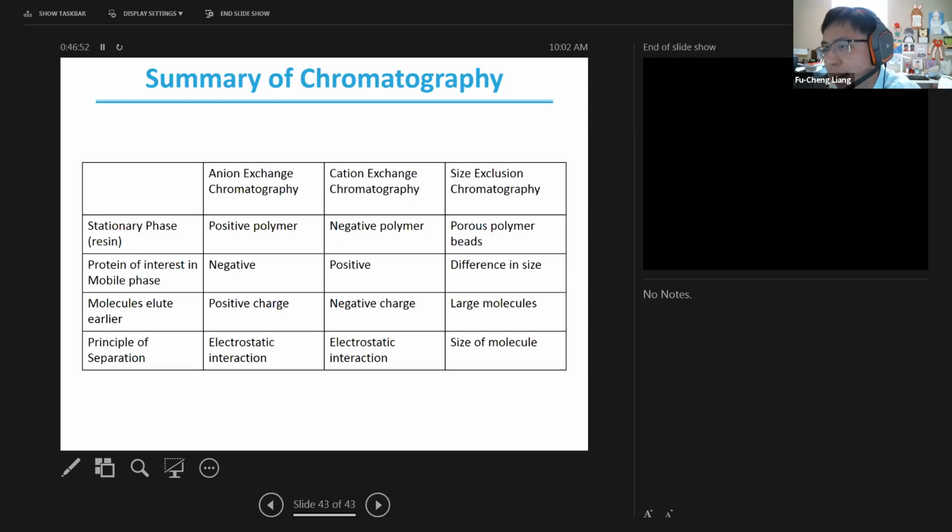All right. So again, for those of you who are going to take biochem, I'm going to text you guys this. But for those of you who don't want to take biochem, don't worry about this. All right. So this technique has been widely used nowadays to purify different kinds of molecules or to purify protein molecules.